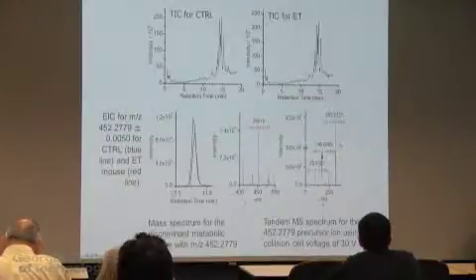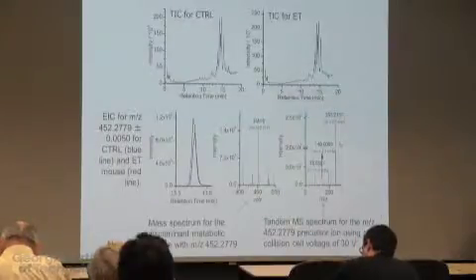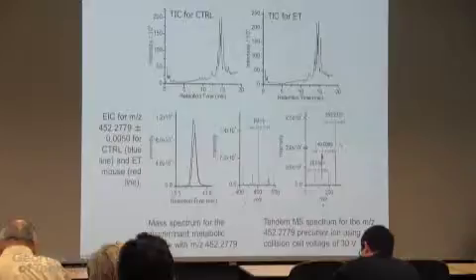And that reason is why we rely on really high resolution instrumentation, because we want this number to be very reliable and we don't want any peaks to overlap. If you have overlaps, you may be looking at 2 molecules at once, and that's going to distort all the picture. Okay, so that's why we need high resolution measurements.